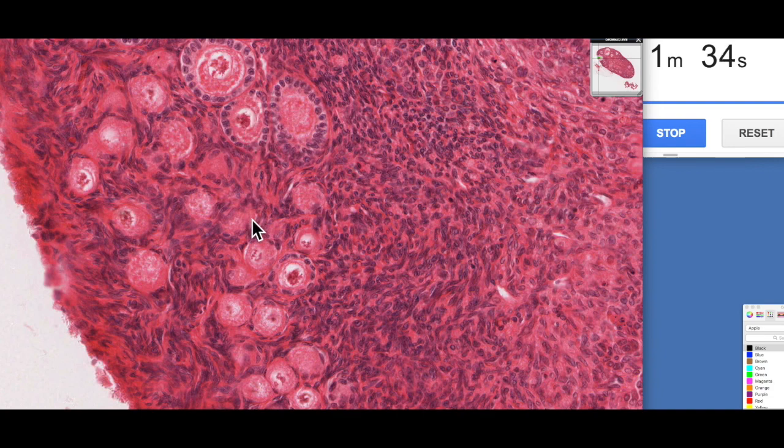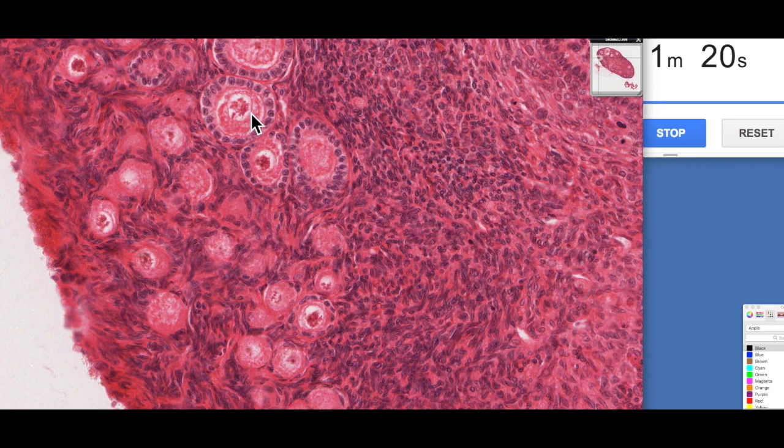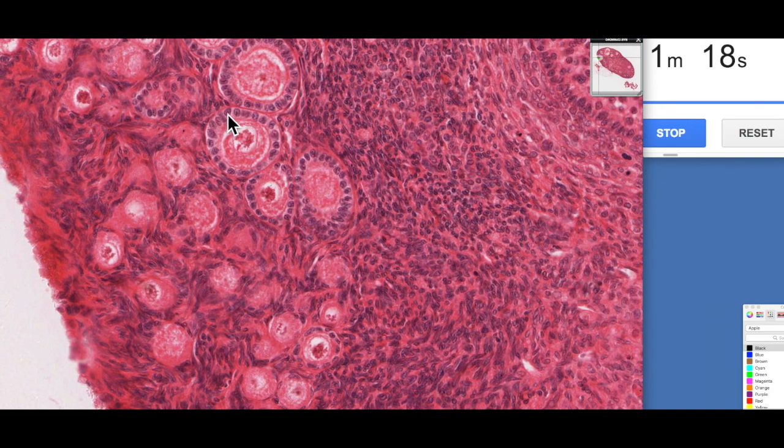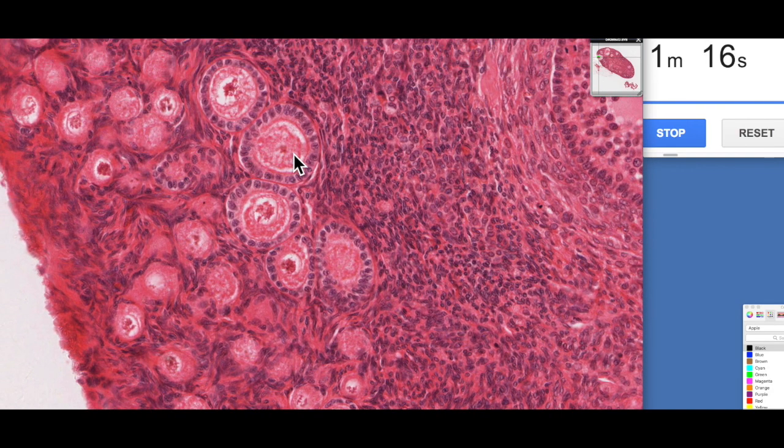So you can see one here. You can see the difference between these two here now. The oocyte has increased in size. So here's its nucleus here. So this is the cytoplasm of the oocyte. We've got our single layer of granulosa cells. They continue to grow. So here's one slightly bigger.